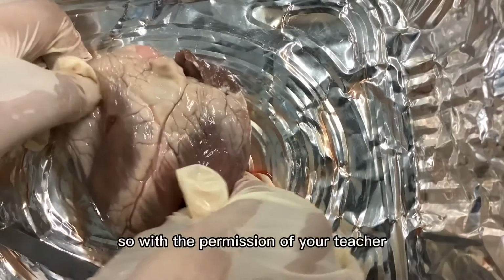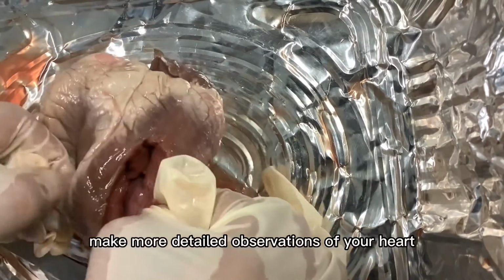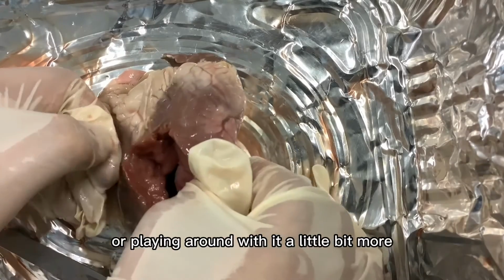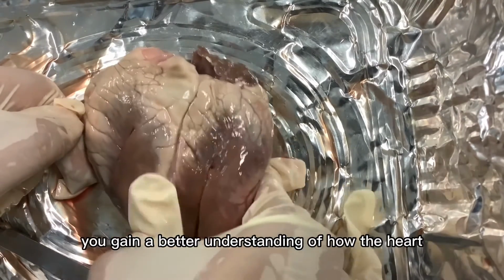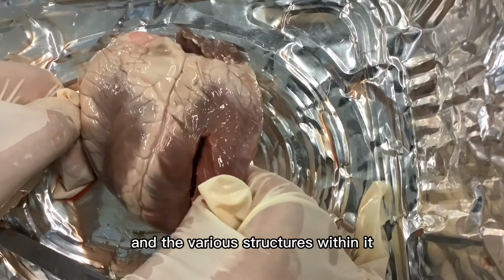Alright, so with the permission of your teacher, you can go ahead and make more detailed observations of your heart by making more cuts or playing around with it a little bit more. And hopefully through this practical, you gain a better understanding of how the heart actually functions, how it pumps blood, and the various structures within it.